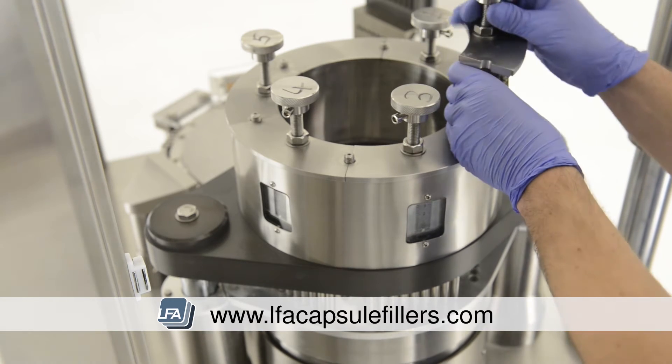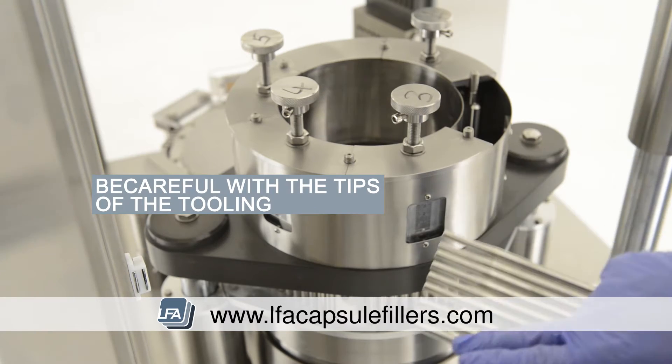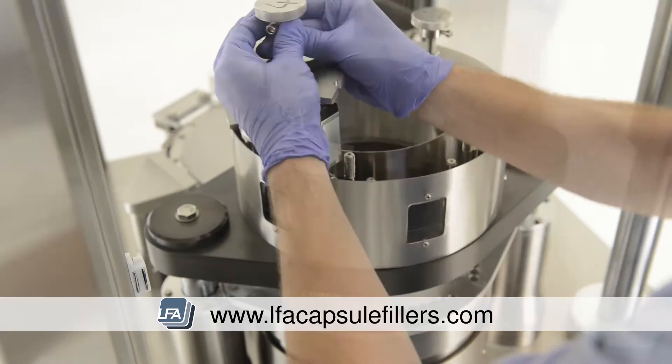Next, we're going to remove the tamping tooling. This can be done in any order. Be very careful with the tips of the tamping tooling as they're fragile. Lay them down gently so as not to damage them.